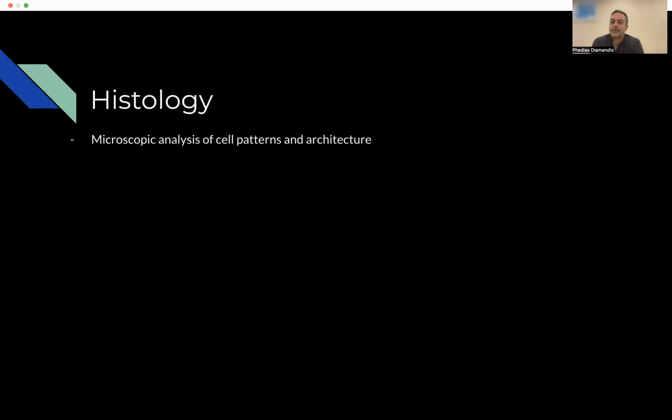So what did we just do there? What's the definition of H&E or histomorphology? It's really the microscopic analysis of cellular patterns and architecture. So what type of cells are in tissues, as we saw, and what architecture are they forming? We can learn a lot by the specific structures that cells form by interacting with themselves and other cells. And this is really the basis of histomorphology.